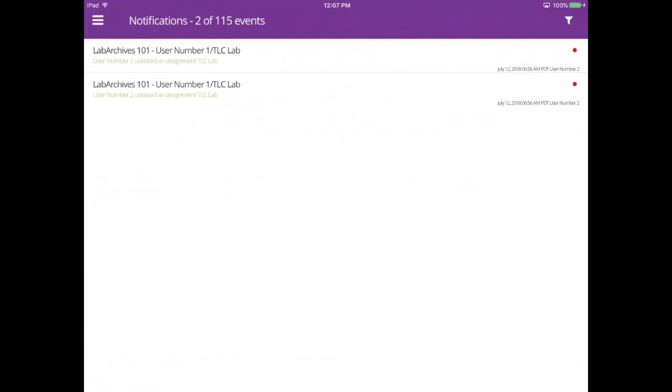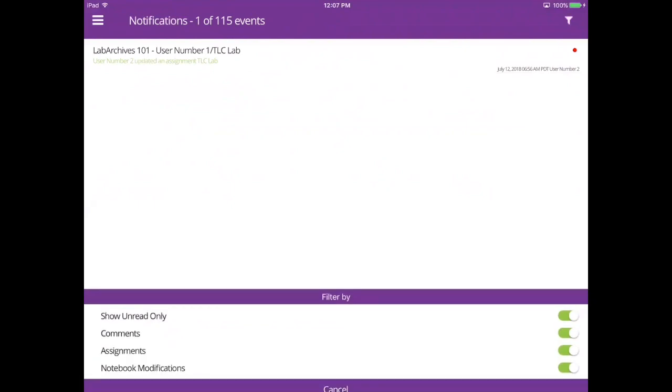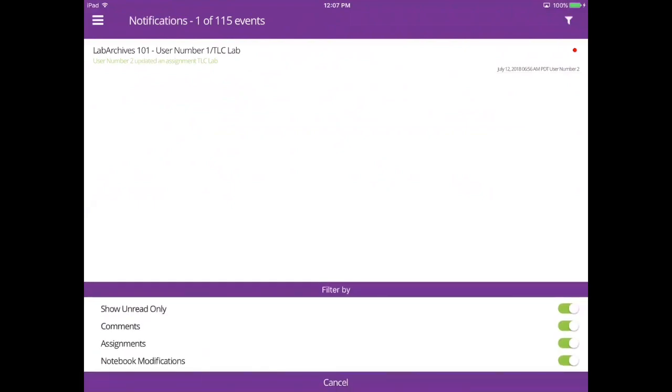To view the page or entry, tap on the notification, and to mark it as read, tap the red circle. You can also use filters to find a specific notification.